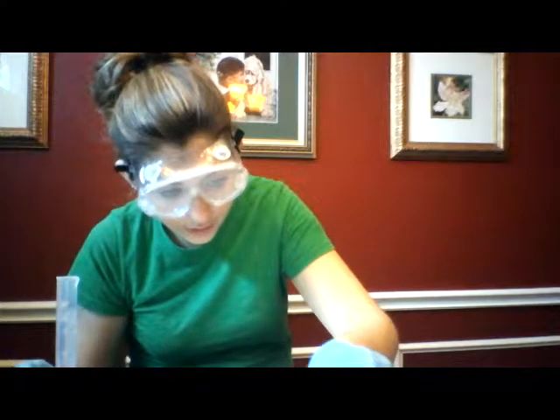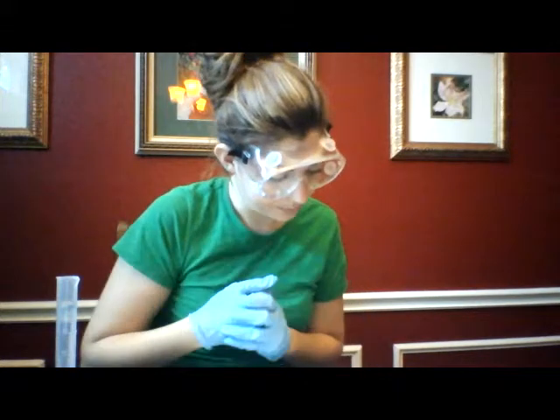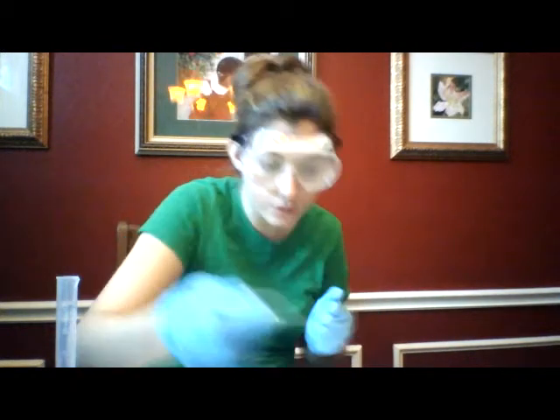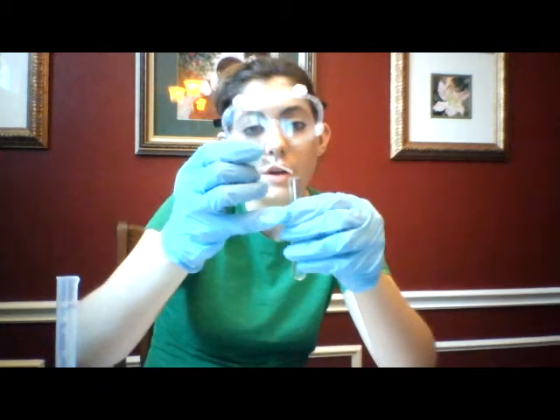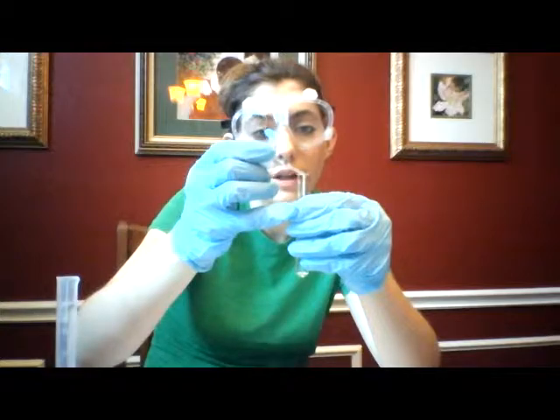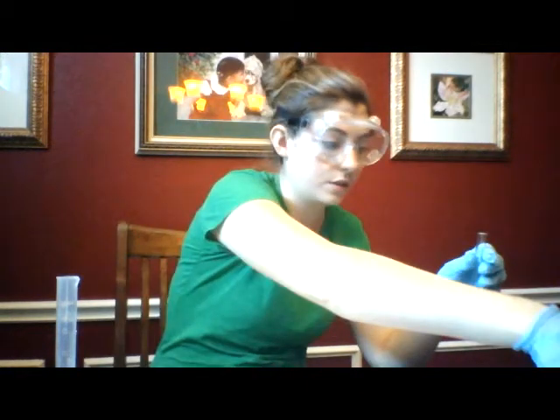In our second test tube, we're going to add another 8 drops. So 1, 2, 3, 4, 5, 6, 7, 8. Still silver nitrate. So here's our silver nitrate.